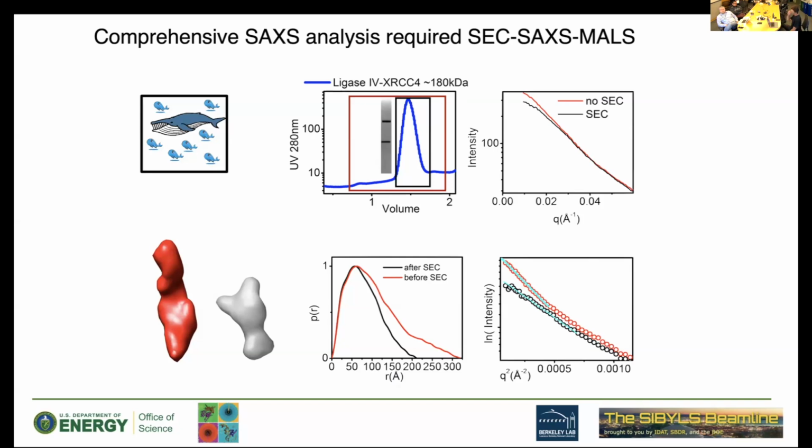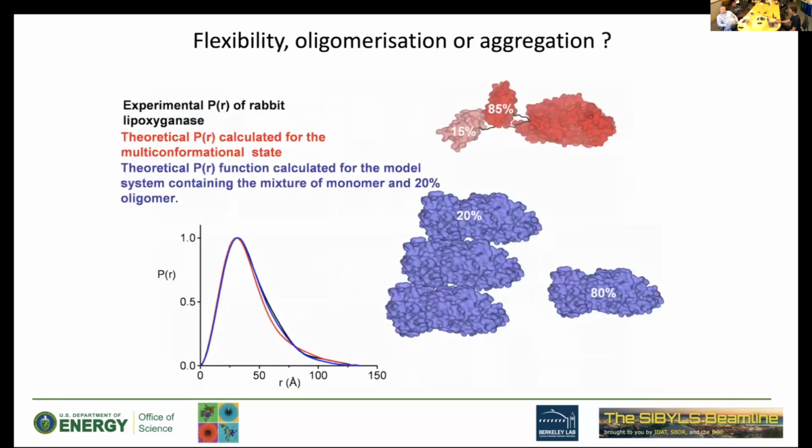Yeah, I kind of get this. I would just say, yeah, for the aggregates or condensates, start with a high throughput, and then if you want to clean up, what we want to do also with new separation methods, the FFF that we mentioned, could be possible to separate different aggregates, different sizes. Yeah, that's also kind of a new technique.